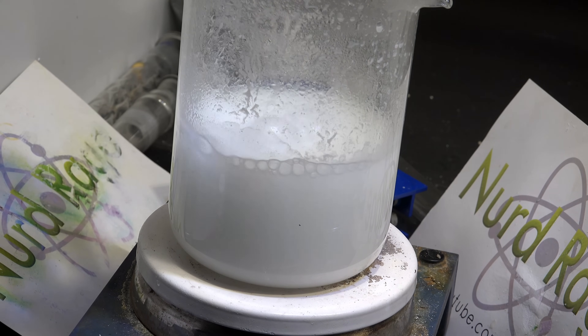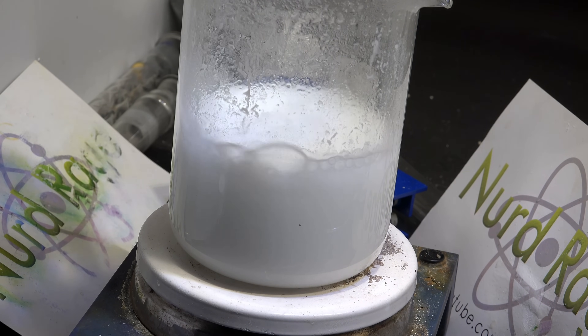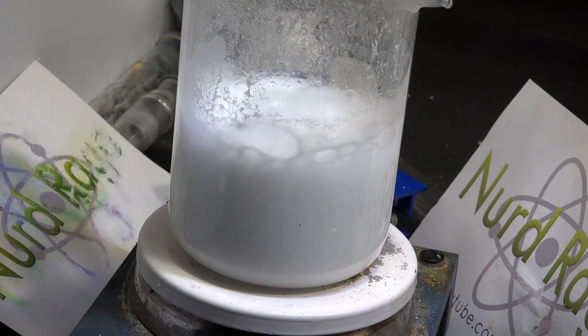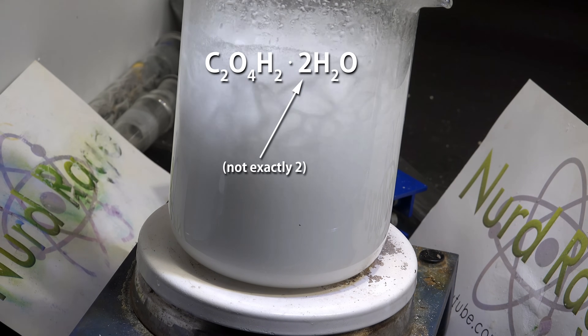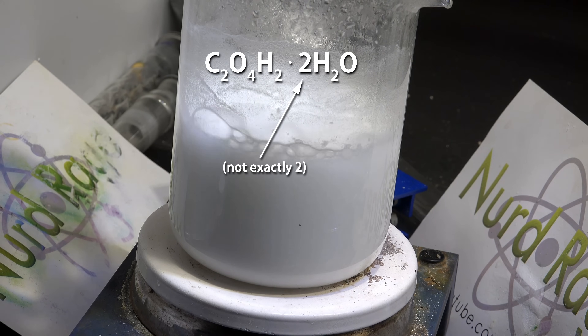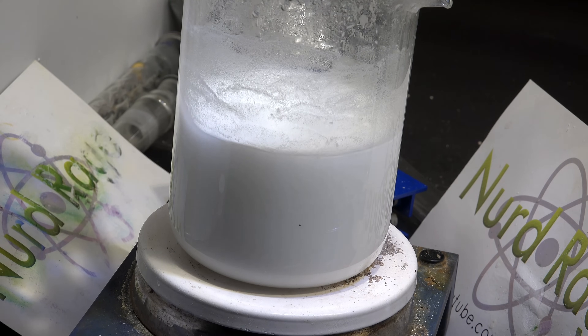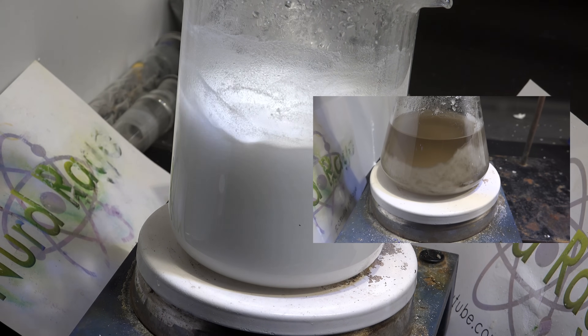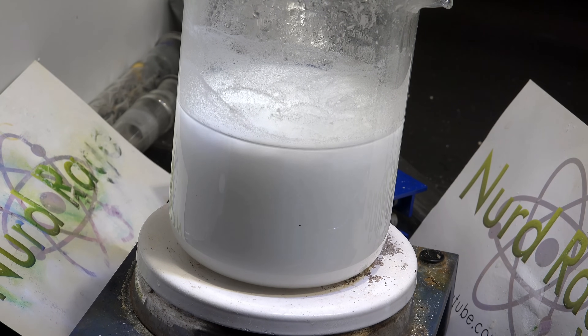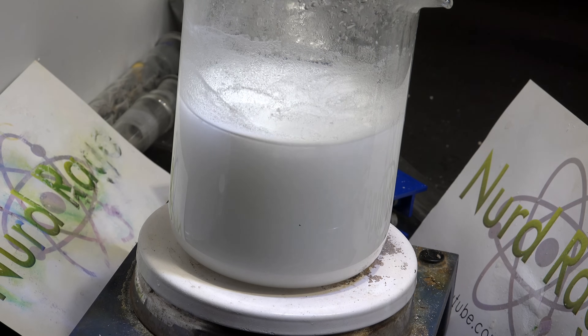You might be wondering why we're bothering to make sodium oxalate as a standard for redox titrations when oxalic acid is also redox active. The problem with oxalic acid is that it can be somewhat variable in its hydration level — it's not always exactly two water molecules per oxalic acid molecule and can vary by several percent. While this is inconsequential for most chemical reactions, it is unacceptable for analytical chemistry. Heating it up to remove all water is difficult as it tends to decompose. Using other chemicals for azeotropic drying introduces other contaminants, which again makes it unsuitable for analytical chemistry.